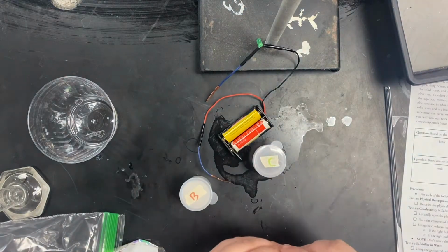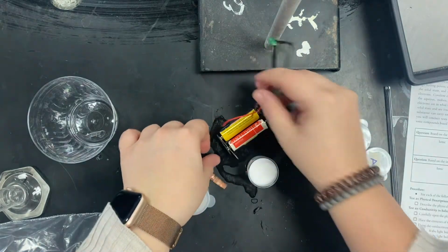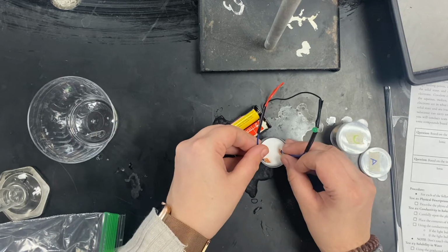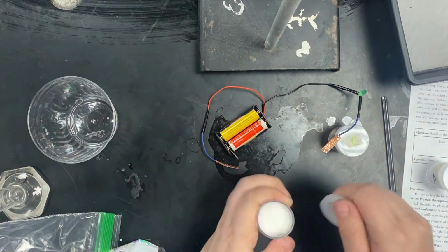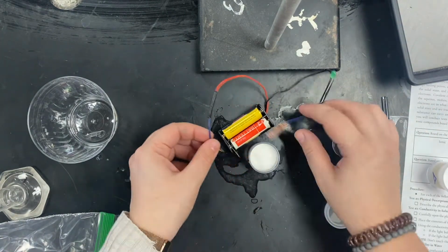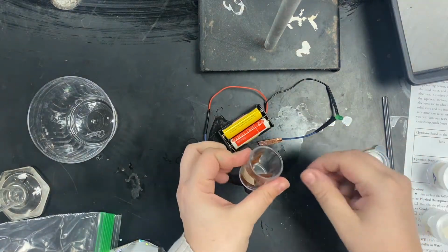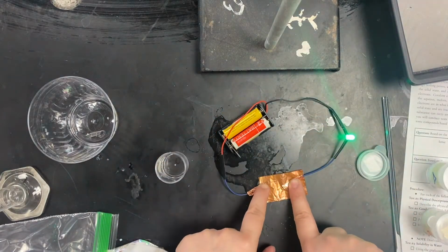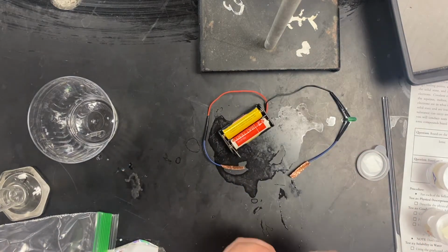To test the conductivity of each thing, you can just pop open the containers and stick both ends into the sample. For A, this is what happens. Close that up. For B, you can do that. And then for C, it may be easier if you take your sample out of the little container, throw it on the table, and then observe what happens there. So that is test number 2.